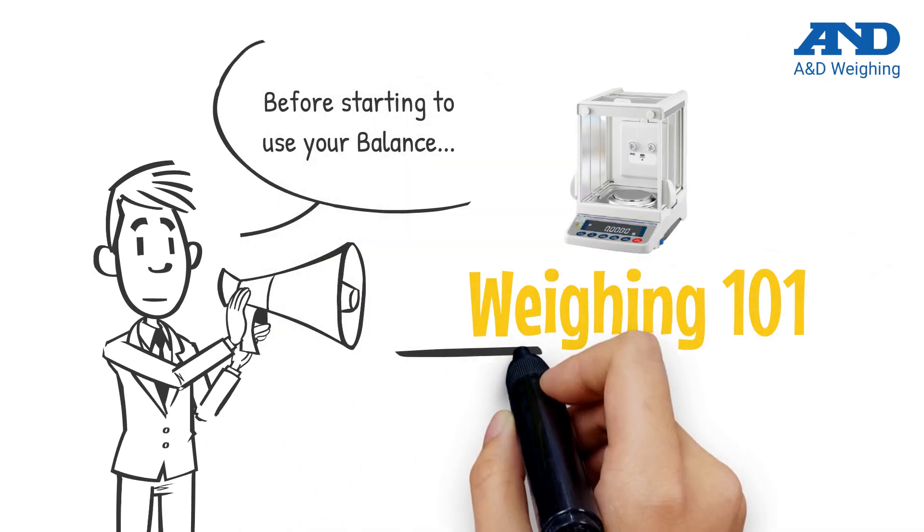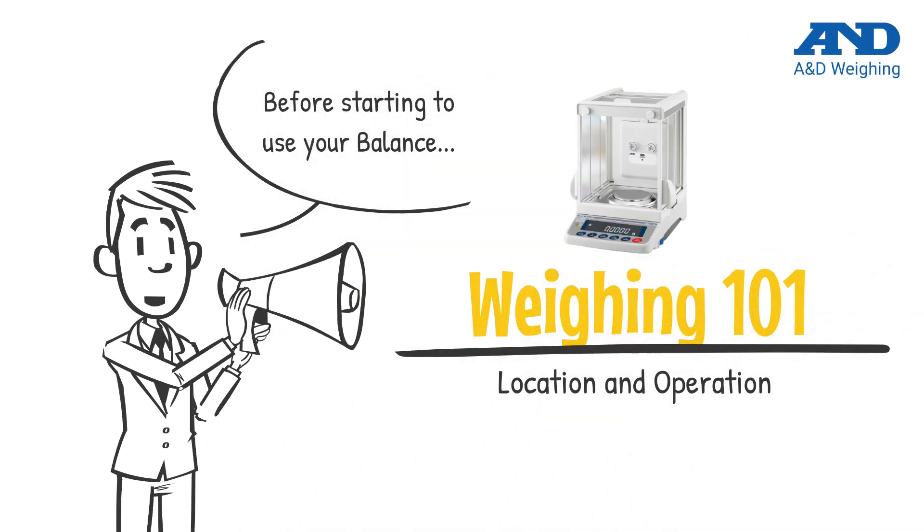Thank you for choosing A&D Weighing. Here are some tips you should know before using your balance.